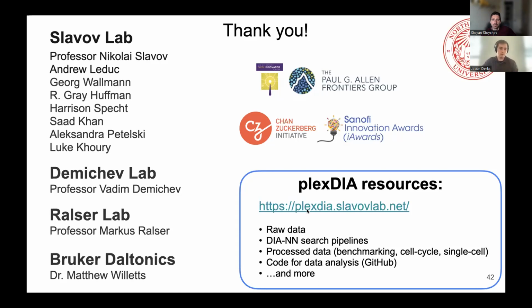But yes, your point, for the single cell analysis, we did have to optimize the data points per peak because the elution profile is going to be a little bit more shallow, because the intensities that you're dealing with are so low. The peak is going to be a little bit shorter. And so, yeah, we had to shorten the duty cycle for that reason.